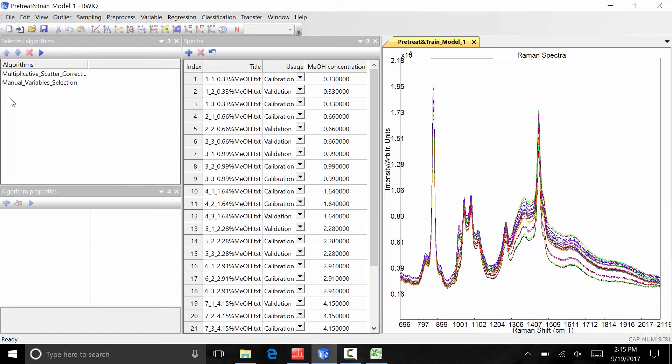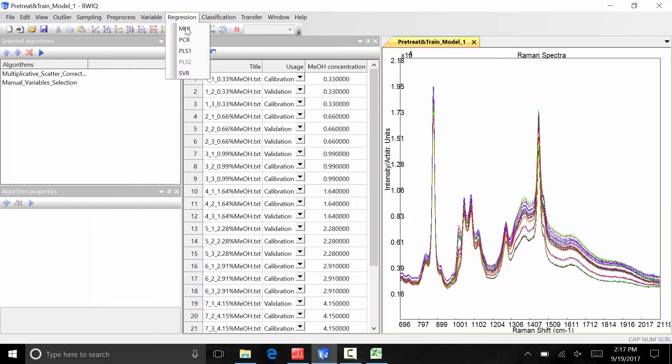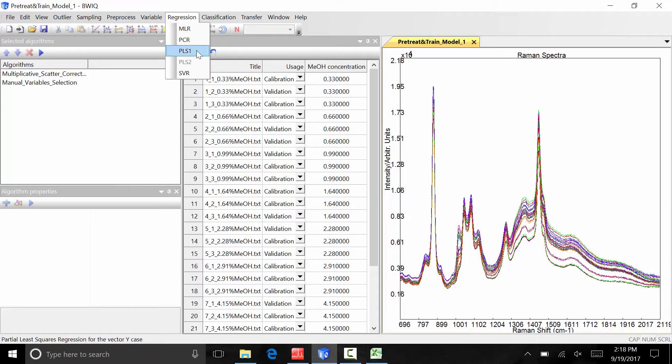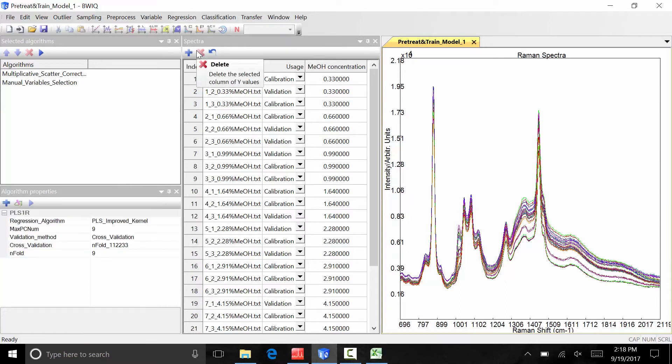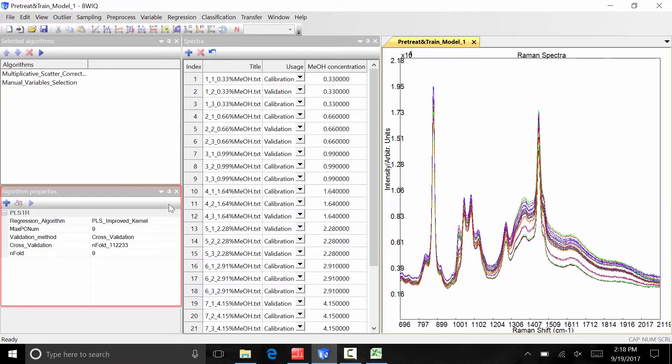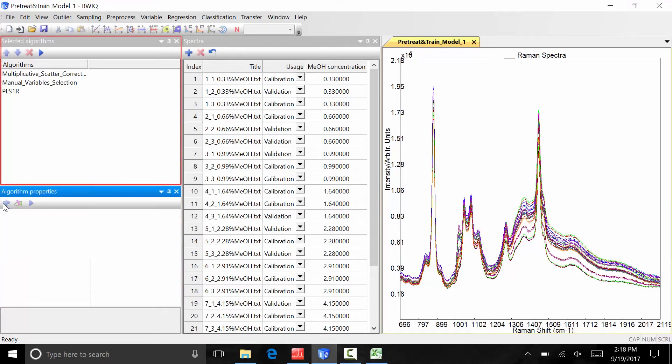Next, we need to select a regression model to apply to the data. In this case, we will choose a partial least squares regression. Under regression, select pls1. Note that the option pls2 is grayed out since in this data there is only one y variable defined. The pls1 algorithm parameters automatically appear in the algorithm properties window. Click the blue addition button at the top left corner of the window to add the pls1 regression to the selected algorithms window. The three algorithms that are listed in the selected algorithms window now make up the steps of our quantitative model.